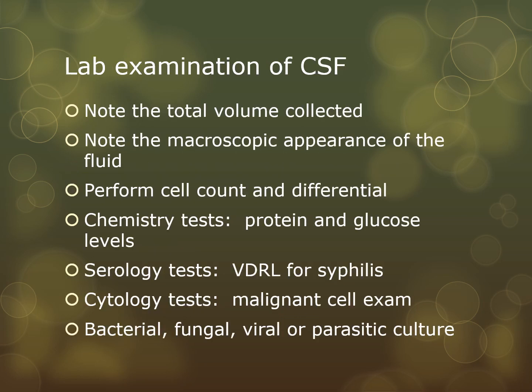All right, so let's go ahead and talk about the laboratory examination of cerebrospinal fluid. First of all, we have to note the total volume collected, and usually the volume that's collected is between half a milliliter and 5 milliliters or so. Usually 5 milliliters is quite a bit.